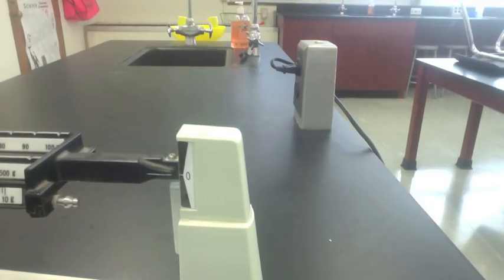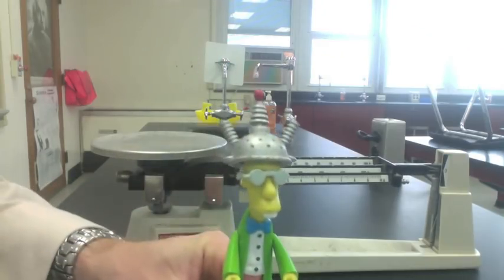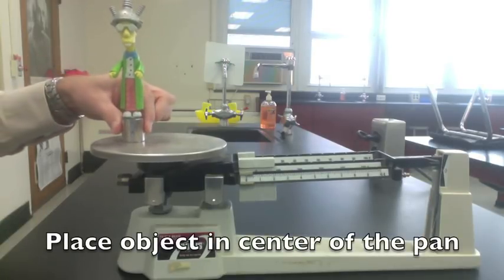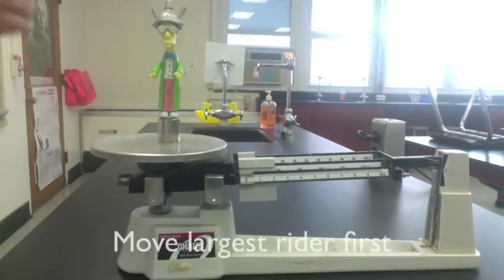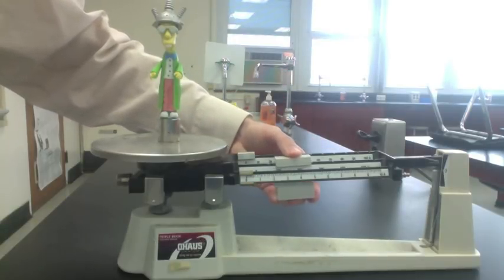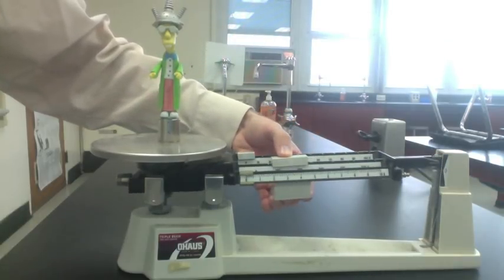With the balance zeroed out, it's time to weigh our object. Let's find the mass of Professor Frink. Put him on the scale — he has to be in the center of the pan. Next, move the largest rider one click at a time until the pointer drops below zero. That means you've gone too far, so move it back one click.